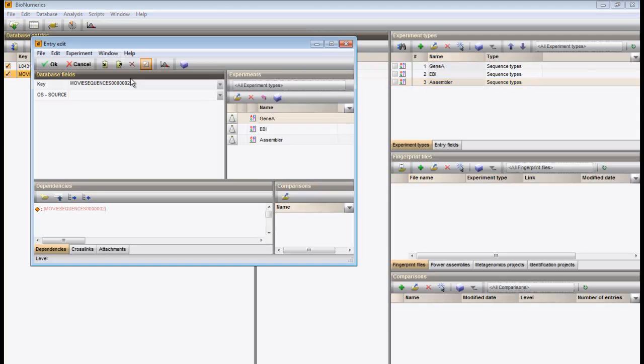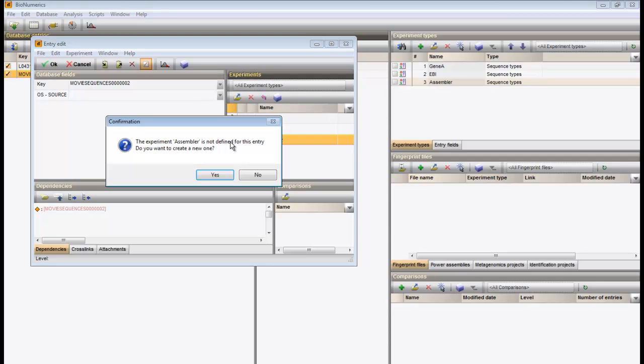Double-click on the newly created entry, and in the entry edit window, click on the flask next to the newly created sequence type.